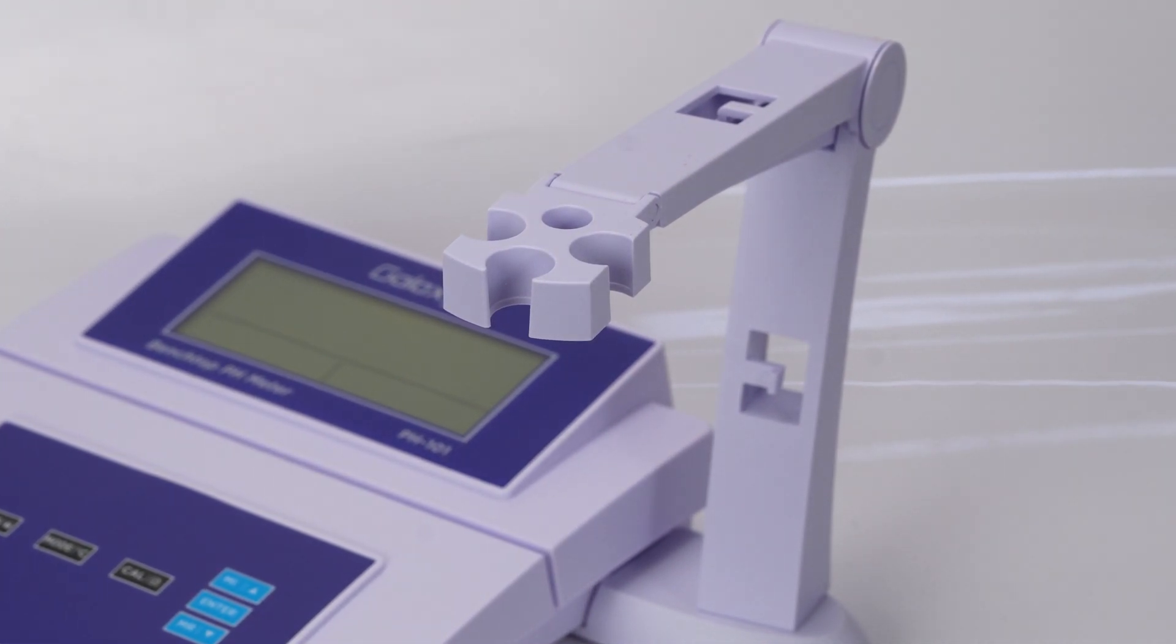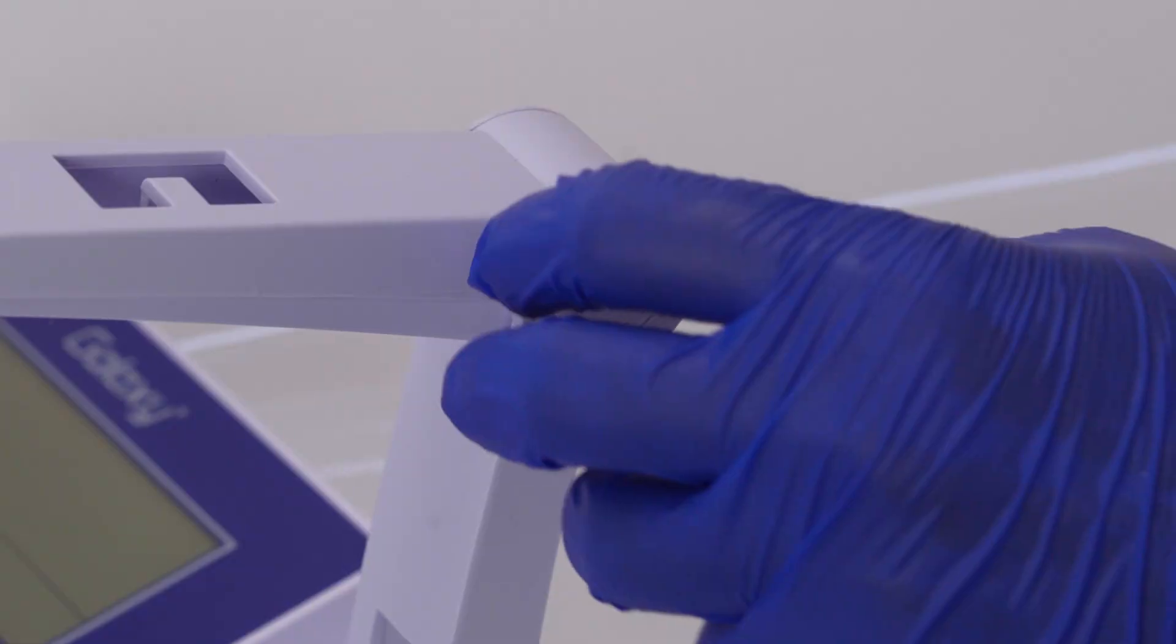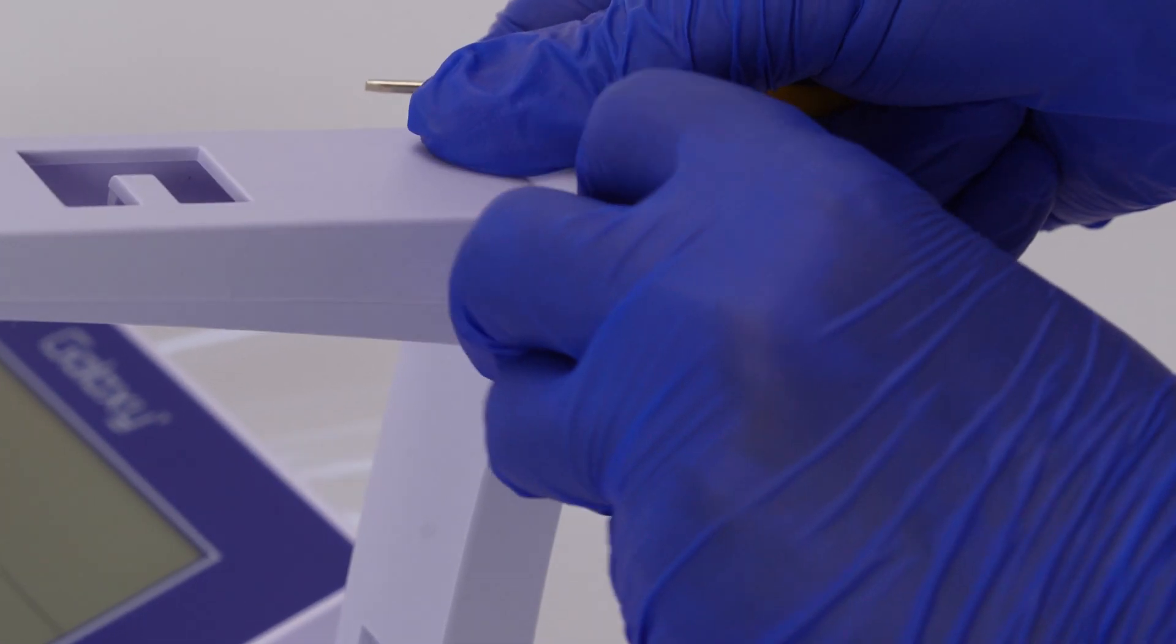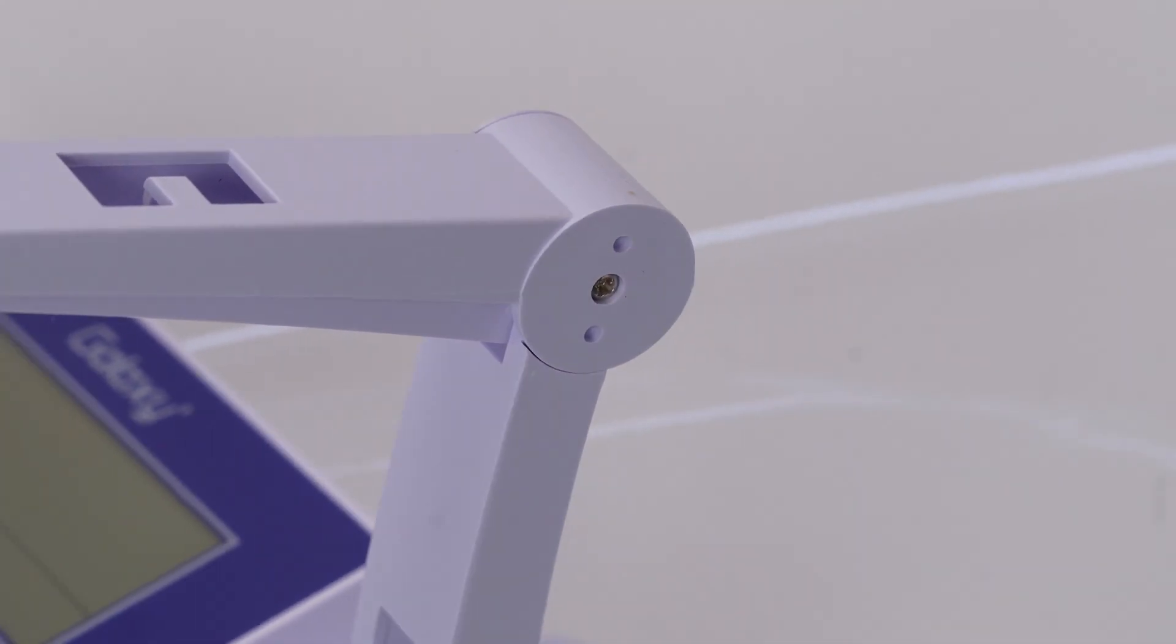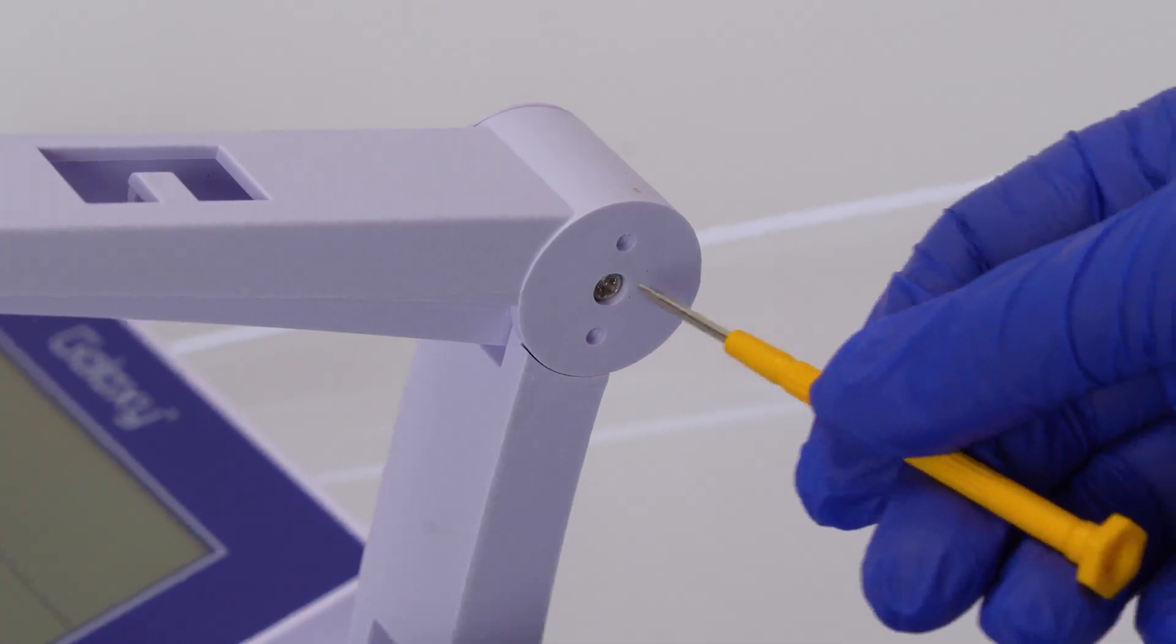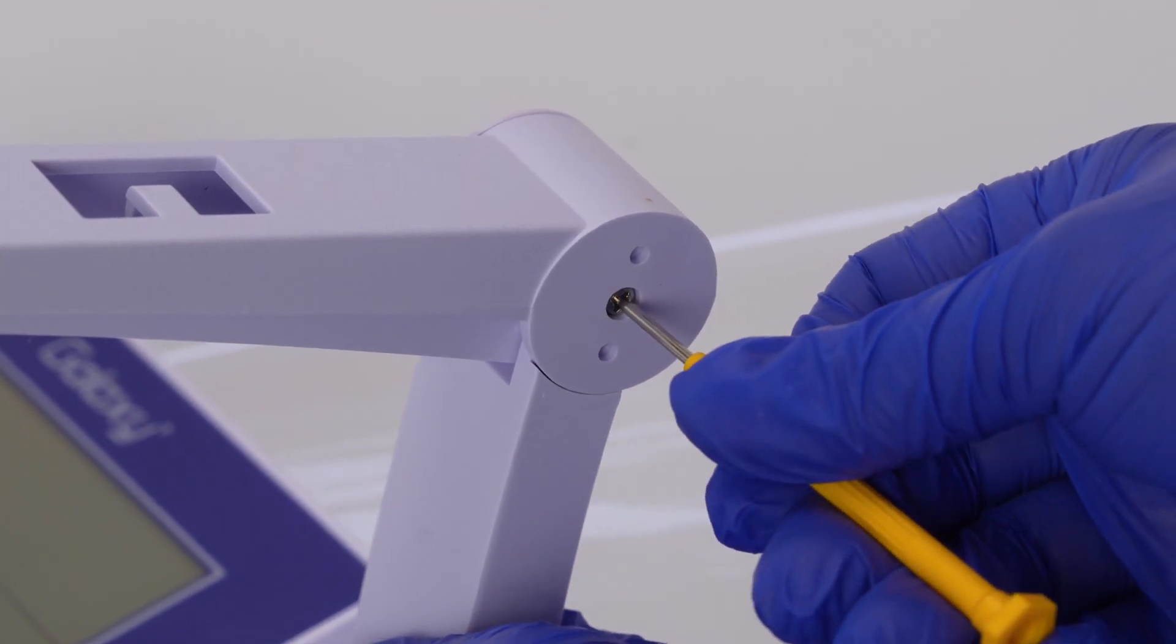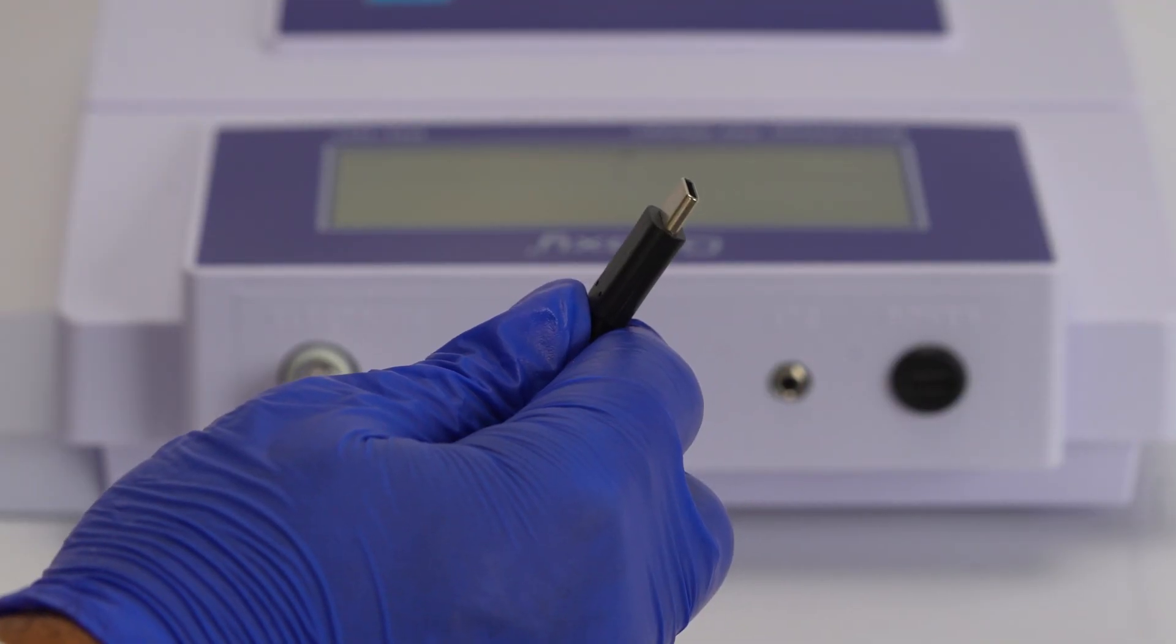If the electrode arm isn't stable, remove the plastic cover on the right side and use a screwdriver to adjust the screw until it holds the desired position. Connect the USB cable to the meter, then plug the DC 5 volt power adapter into the wall outlet.